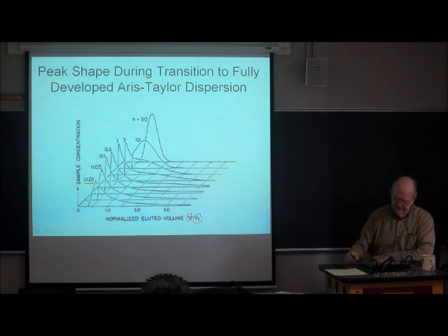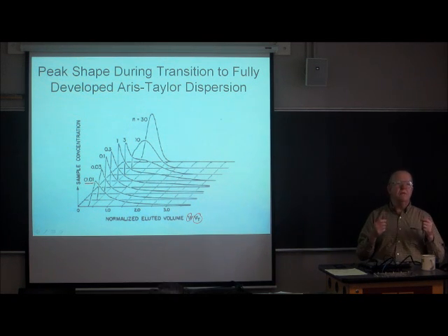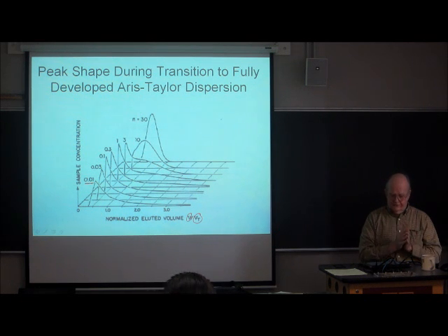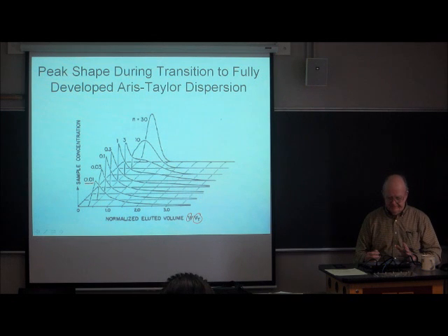This number here corresponds to the number of theoretical plates that are in this tube. You want a lot of theoretical plates, that's going to give you a narrow zone. A lot of plates means the HETP is very small. If you have 1/100th of a theoretical plate, you get a wretched, wretched looking peak.